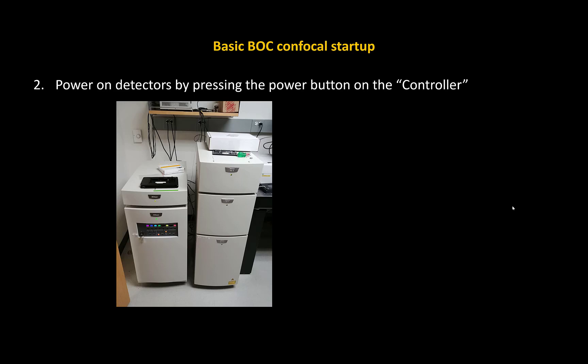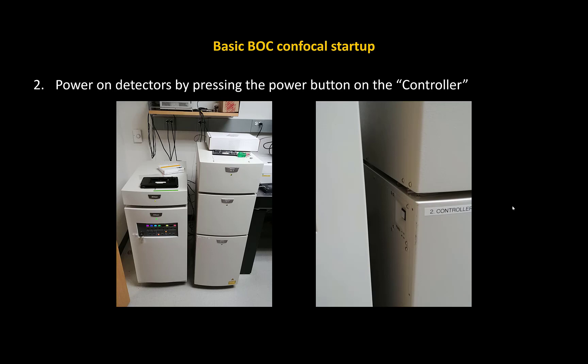The next step is to power on the detectors by pressing the power button on the controller. These are conveniently labeled with numbers. Just to zoom in, the button is located right here — turn it on. The detectors will also take some time to warm up, but collectively the lasers and detectors shouldn't take more than five to ten minutes to completely warm up and be ready to use.